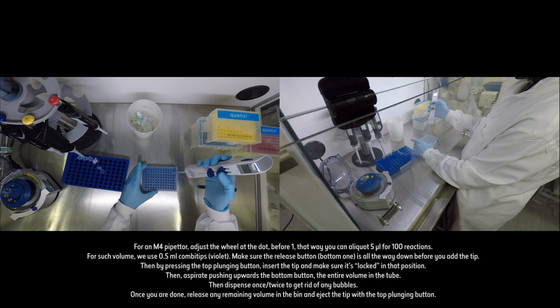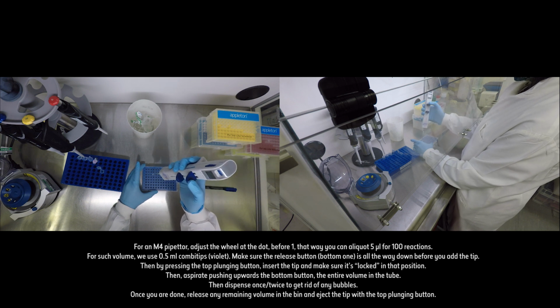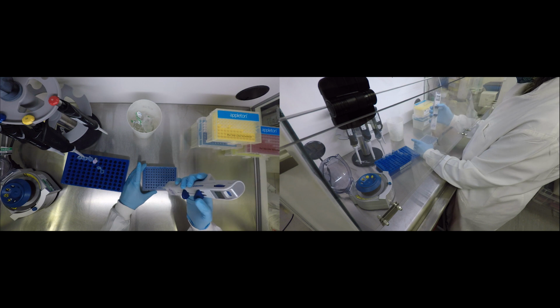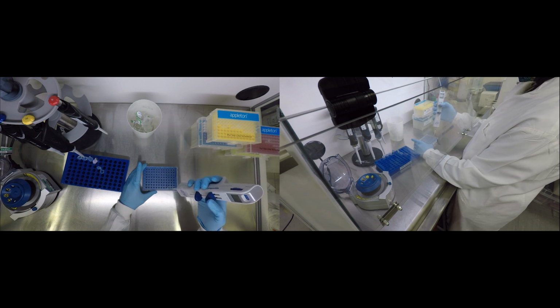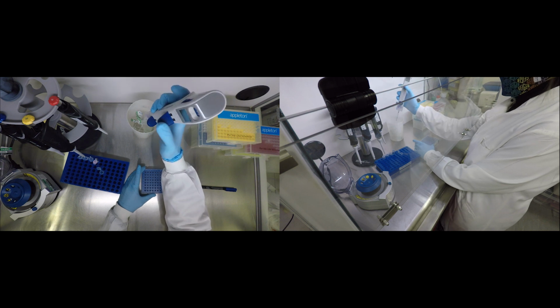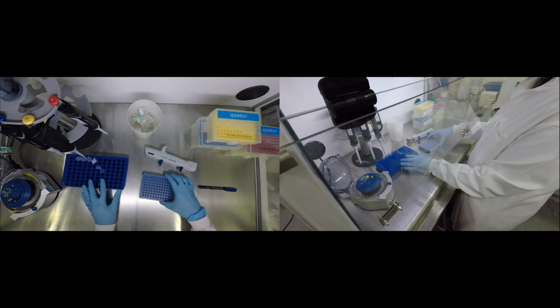Once you have loaded the master mix in all wells, take the plate, cover it in foil and keep it cold for a brief amount of time, or ideally take it immediately to your station to add the DNA samples and standards. Do not forget to clean all the surfaces at the pre-PCR setup and UV the workspace.